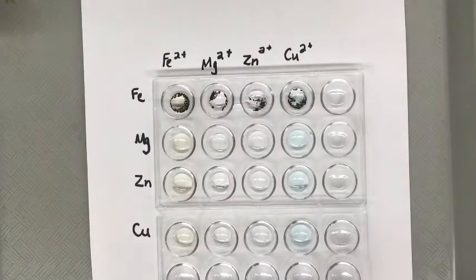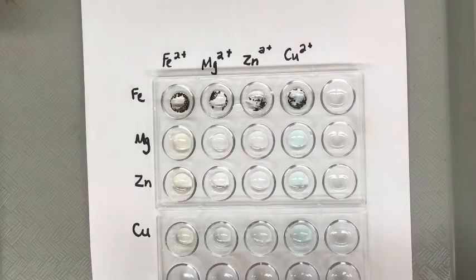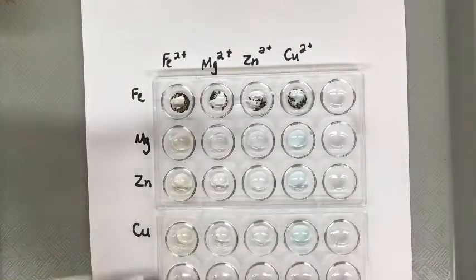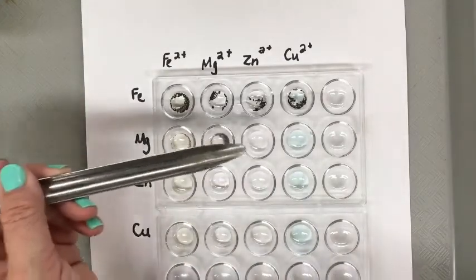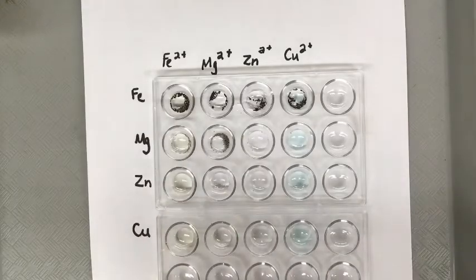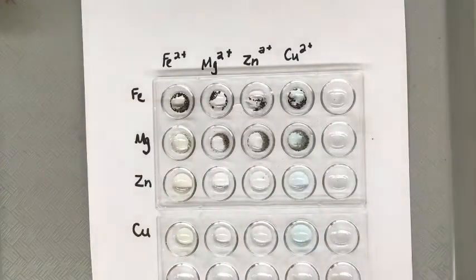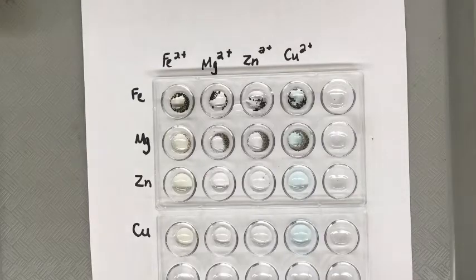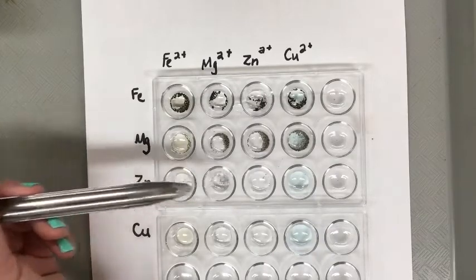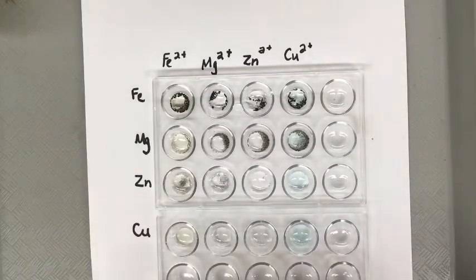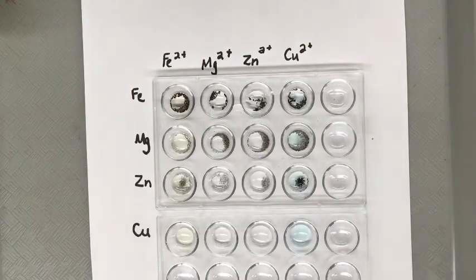Now we'll add a little bit of magnesium in the next one. We'll leave that. And now some zinc. There we go. You can see that the zinc is reacting readily with the copper.